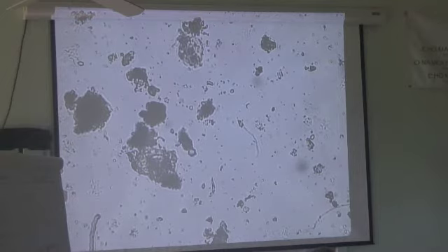So now let's go to our next field. Are you supposed to spend like 30 seconds on a field? Because if you stay there, you can see lots of stuff. So try to keep it down to the time it takes you to count the stuff that's in the field. I don't try to time it in any way. Because if there's absolutely no flagellates or protozoa in here, you'll never see them. So let's pick up a few things that are in here. If they're going to come swimming by, we have to have a pretty good number in here. And remember, this is a qualitative assessment. It is not an absolute quantitative assessment.